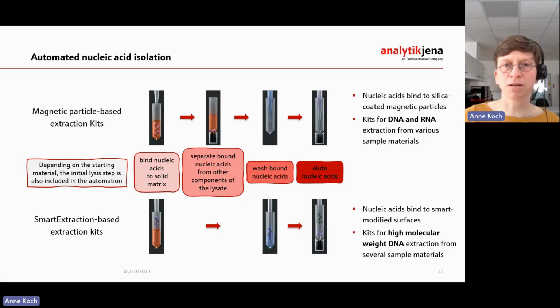And then the device will stay closed. So the doors will stay closed until you confirm the end message, basically. So if the run is done, your samples are safe within the closed compartment of the device, and then you can simply take them out and proceed either to store the nucleic acids, of course, or to go to the analysis.